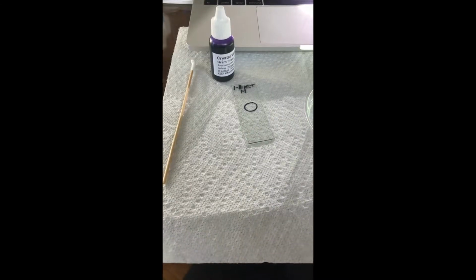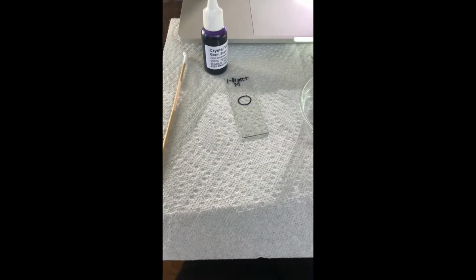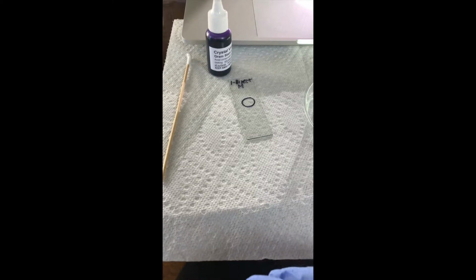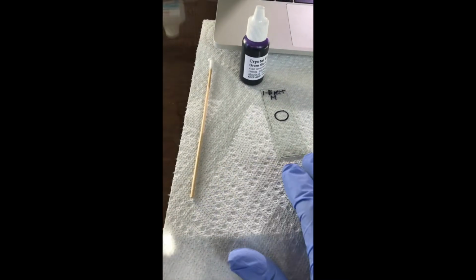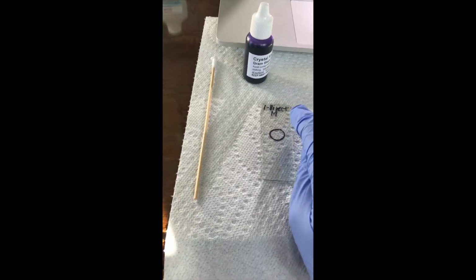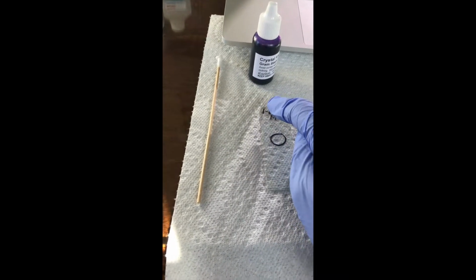Today's date is November 15th, 2018, and today I will be performing bacterial morphology and staining techniques for Bio 225, Week 3 assignments. This portion of the lab is to perform staining techniques, and the first sample is a sample direct from the mouth, and this is the first one.